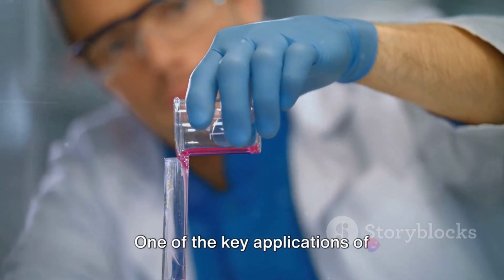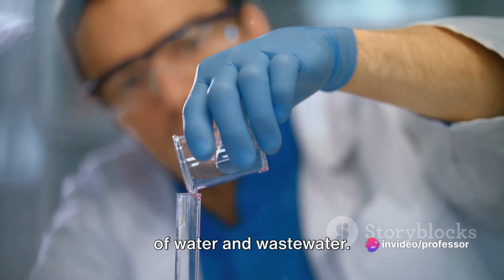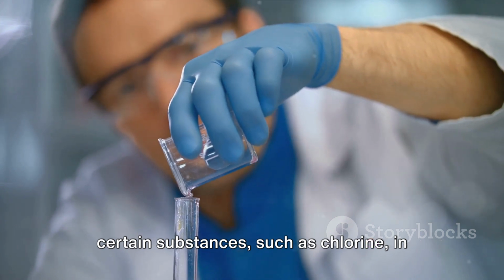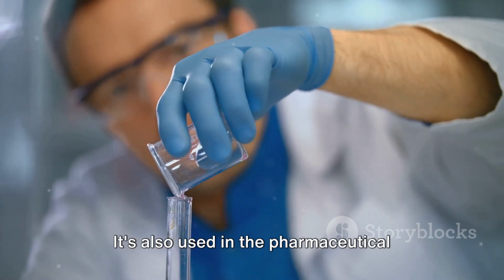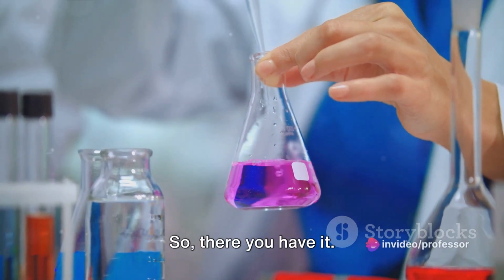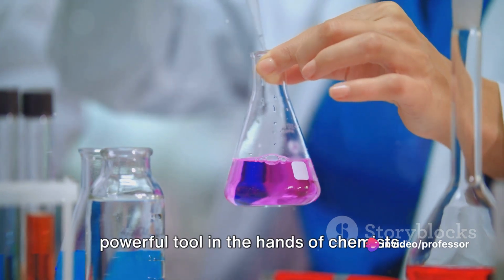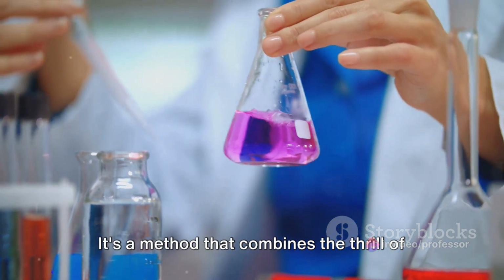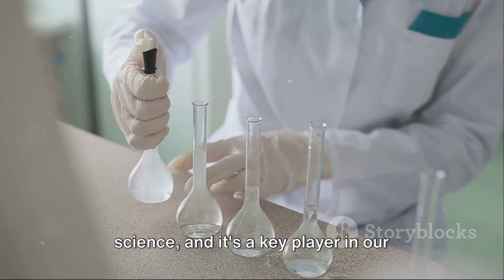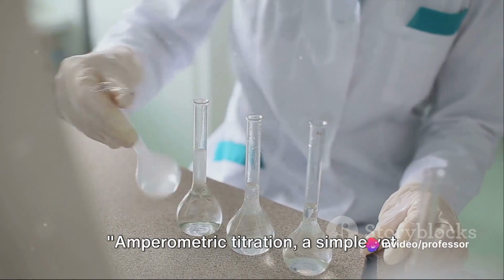One of the key applications of amperometric titration is in the analysis of water and wastewater. It's used to determine the amount of certain substances, such as chlorine in the water. It's also used in the pharmaceutical industry to analyze drug components. So there you have it. Amperometric titration, a simple yet powerful tool in the hands of chemists. It's a method that combines the thrill of a detective story with the precision of science, and it's a key player in our quest to understand the world around us.